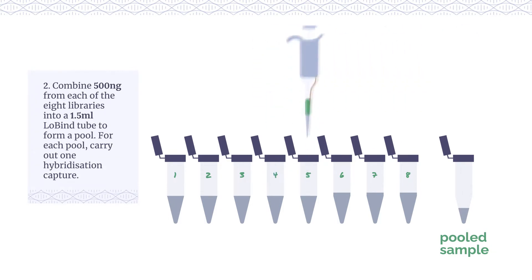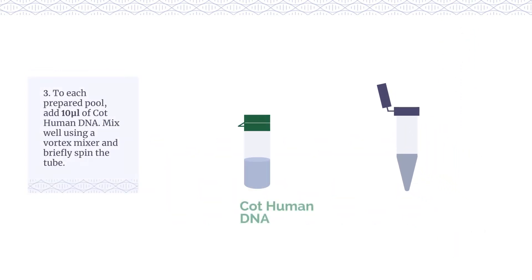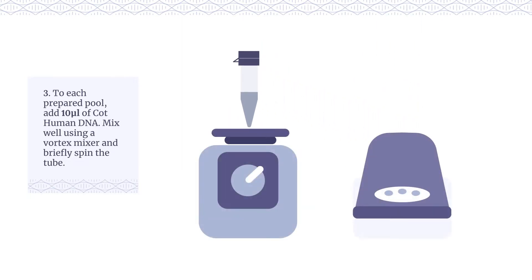Combine 500 ng from each of the 8 libraries into a 1.5 ml low-bind tube to form a pool. For each pool, carry out one hybridisation capture. To each prepared pool, add 10 µl of cot-human DNA. Mix well using a vortex mixer and briefly spin the tube.